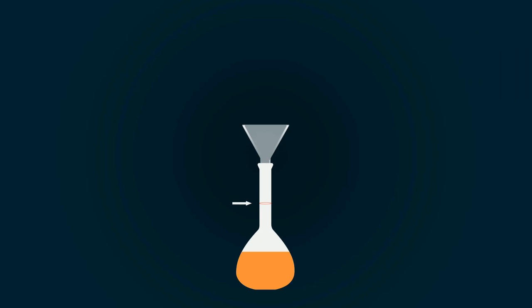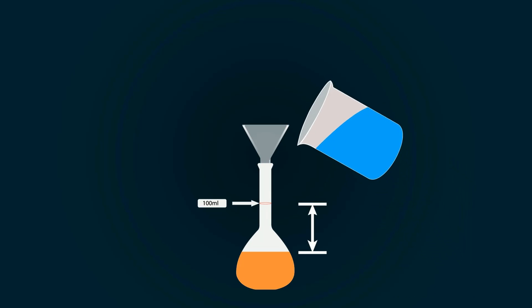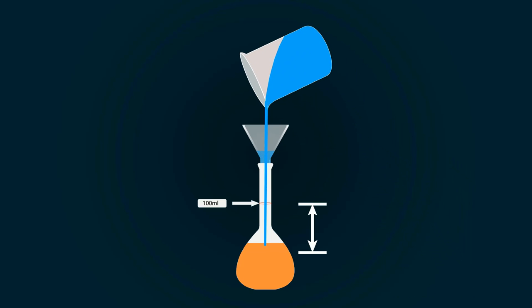You have to fill it up to the 100 milliliter point. For that, you have to add distilled water in it. So take some distilled water into an empty beaker and pour it into the measuring flask to fill it up to the 100 milliliter mark.